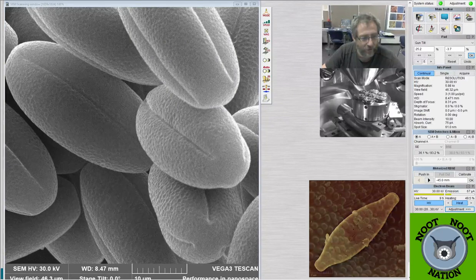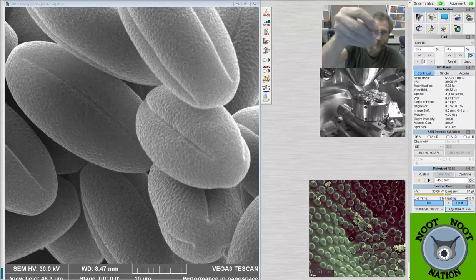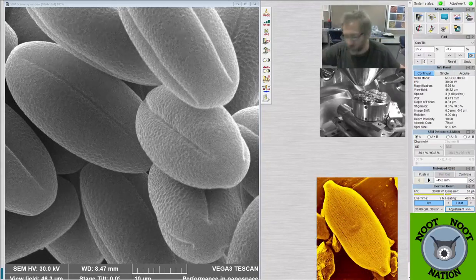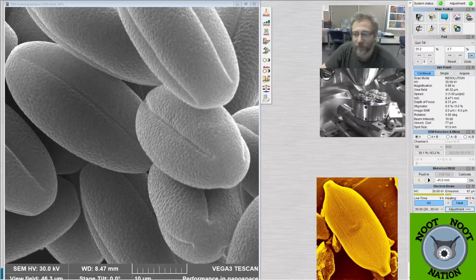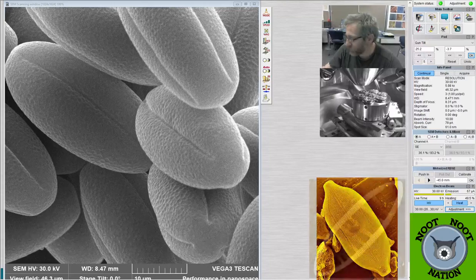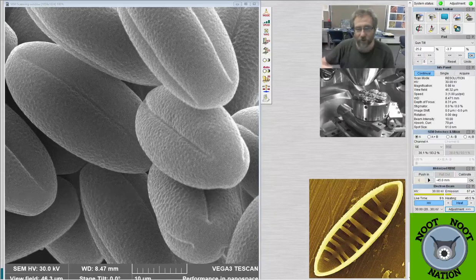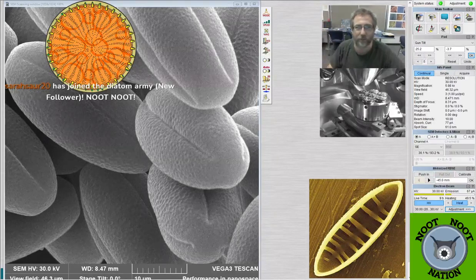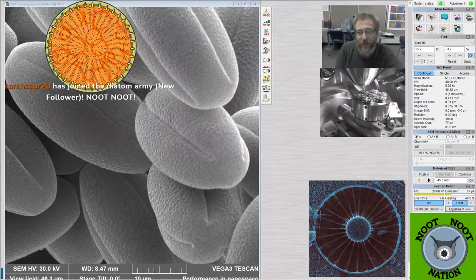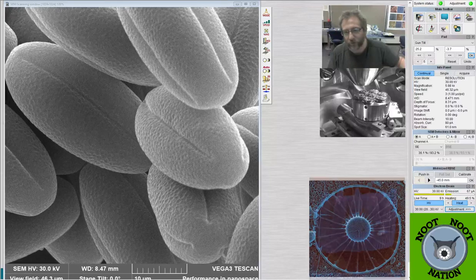What are we looking at right now? Right now we're looking at pollen. So I started out the day by collecting a little bit of pollen from a bunch of different plants. This one is redbud, a common tree on the landscape in Indiana where we are. What I did was I took the plants and disassembled the flowers onto a little stub, which are the things that you can see me down below in the actual SEM here. There's a little bit of carbon tape that they're stuck to, and from there, basically, I just sputter coated them in gold and then stuffed them in the SEM.